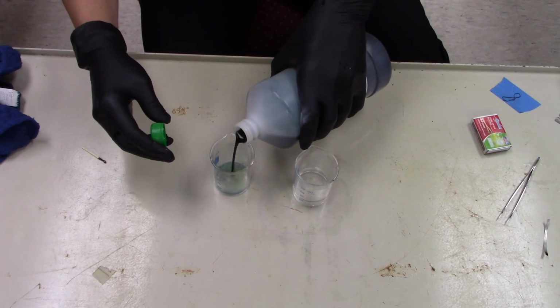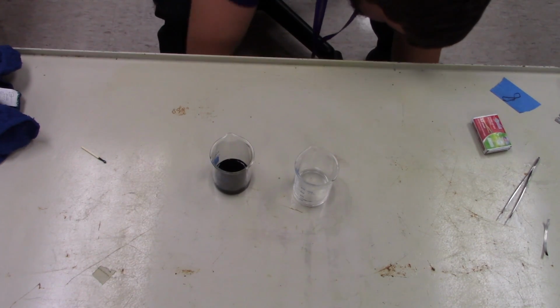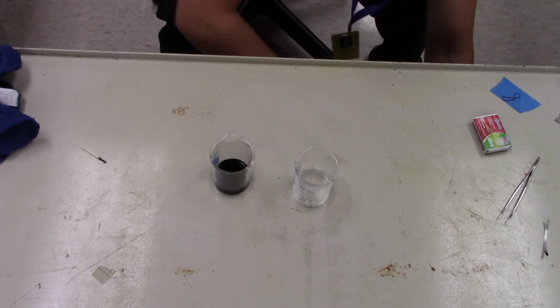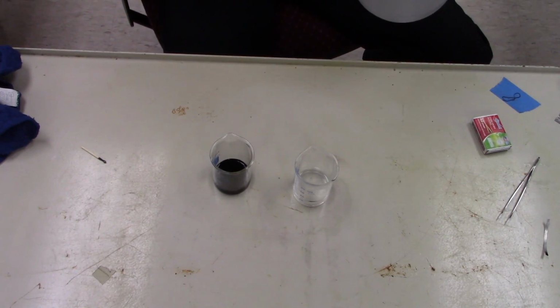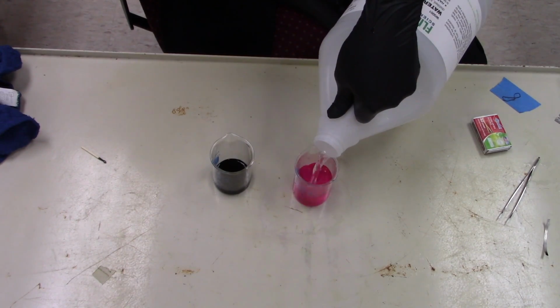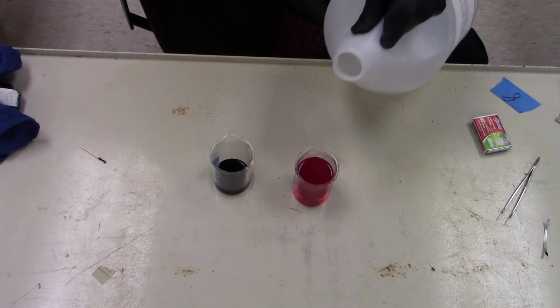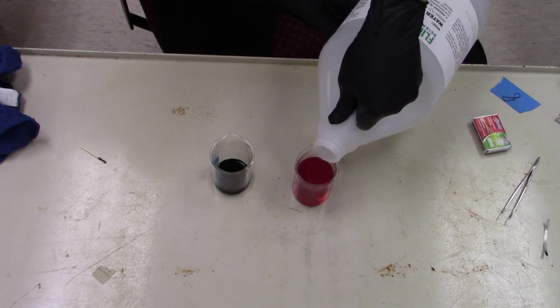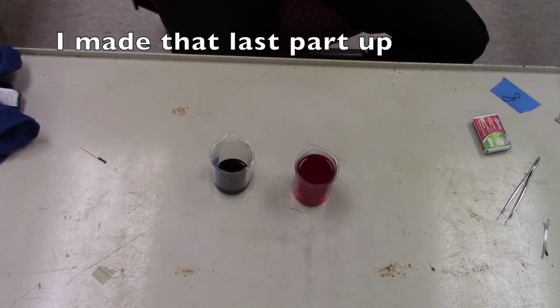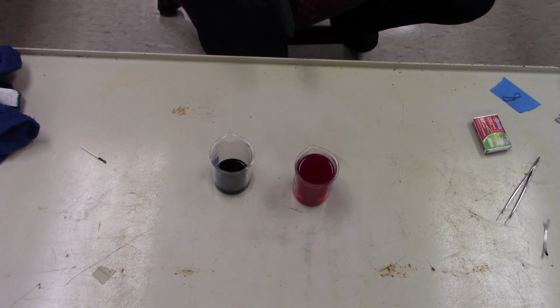This stuff is called bromothymol blue, and it's used just to test acids and bases. Phenolphthalein is used to test for bases, whereas the blue stuff here is used to test for acids. Acids and bases are, well, that wasn't supposed to happen. You see how it just changed color right there? So I diluted it with water, but there must have been something mixed in there that was basic. So it changed color. That's what it's supposed to do.